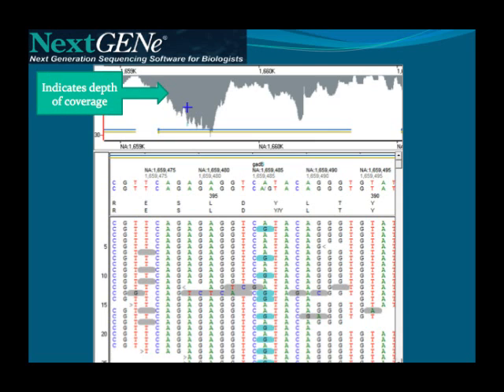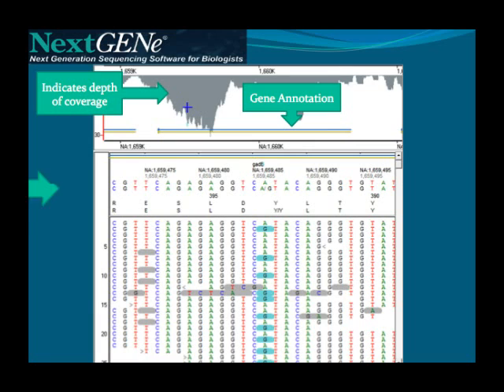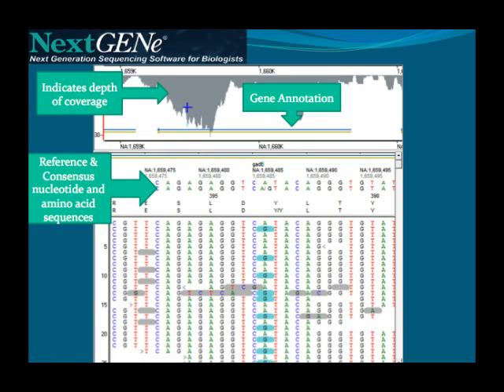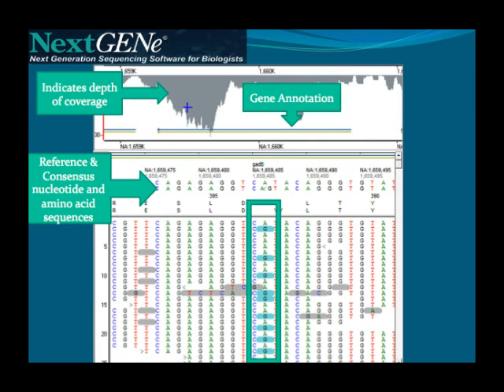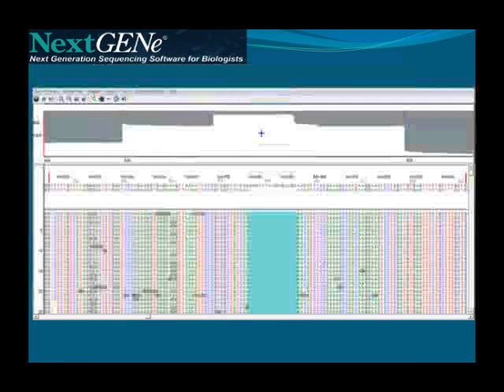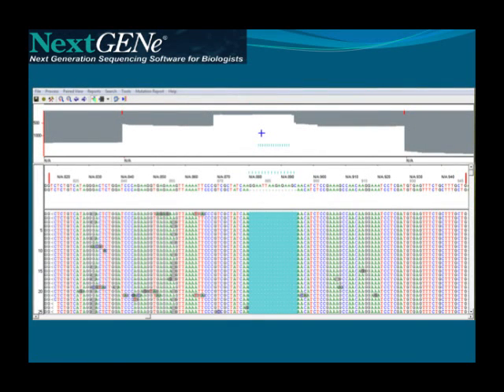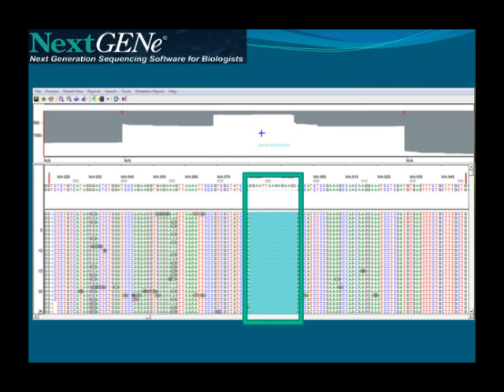Depth of coverage is indicated by the gray shading. Gene and CDS regions are indicated with the blue and gold arrows. The reference and consensus nucleotide and amino acid sequences are shown, with the reference sequence on top. Individual aligned reads are shown, with mutations highlighted. Shown here is a 16-base pair deletion, highlighted in blue, that was detected with IonPGM amplicon sequencing data.